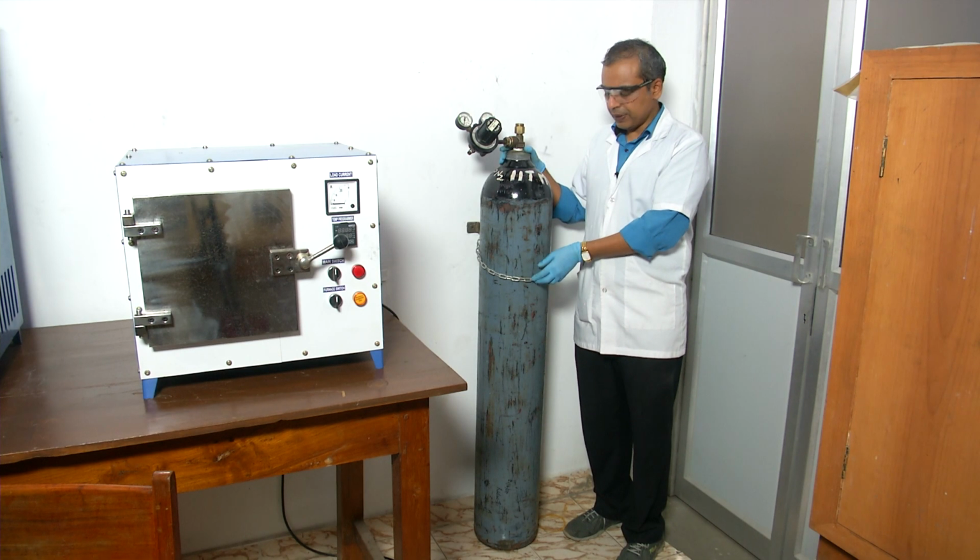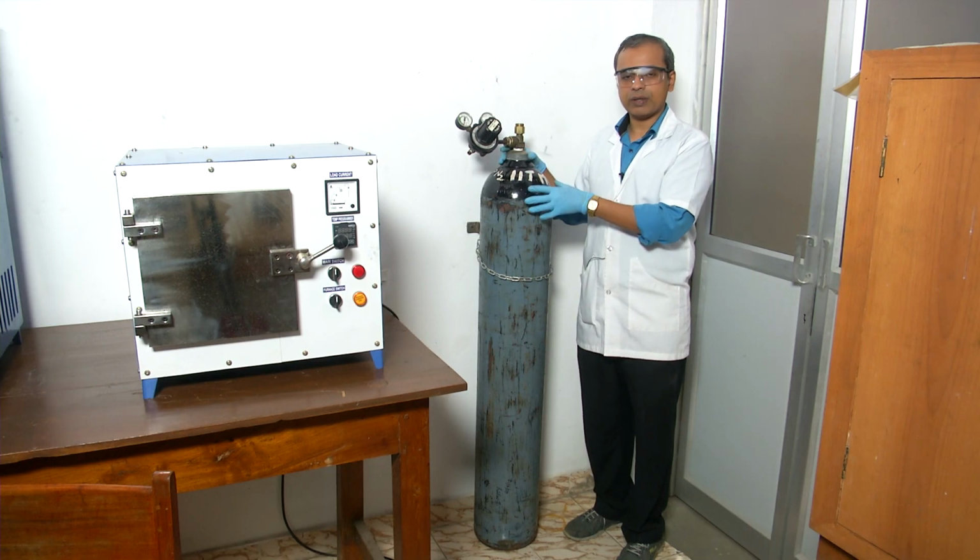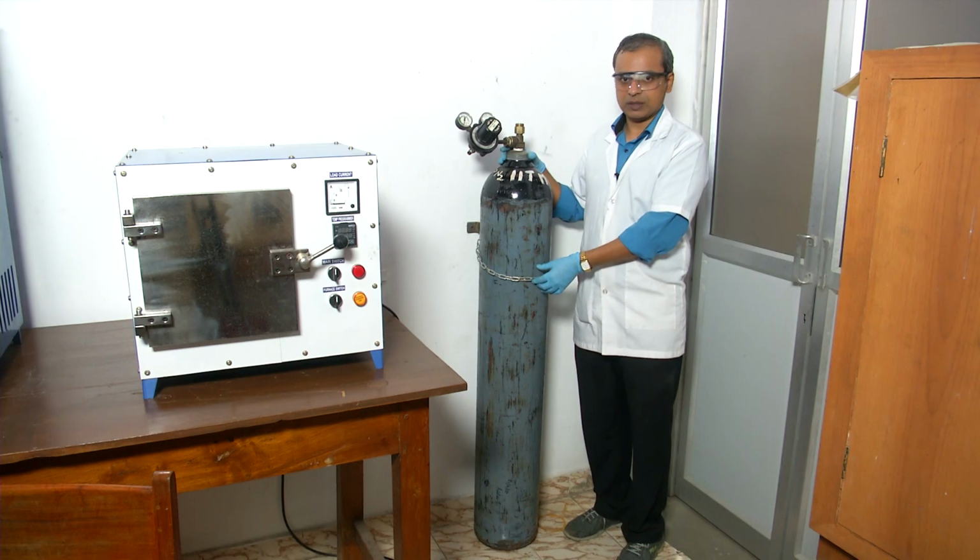So, this is a very simple thing that you can do, but it greatly enhances the safety of your laboratory and your experiment, and it is an absolute must. You should not have a gas bottle which is not secured in your lab.